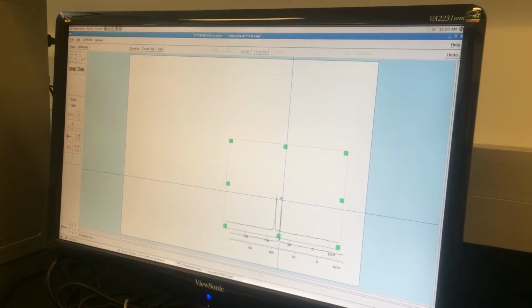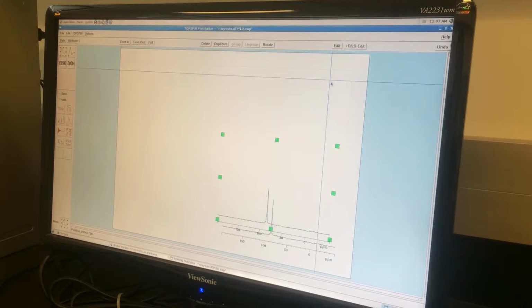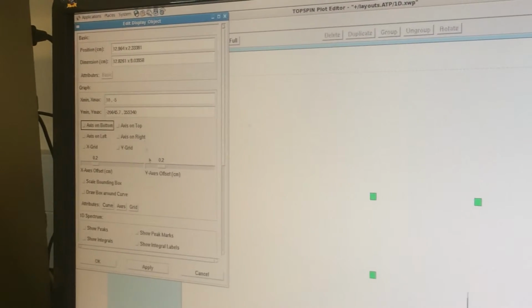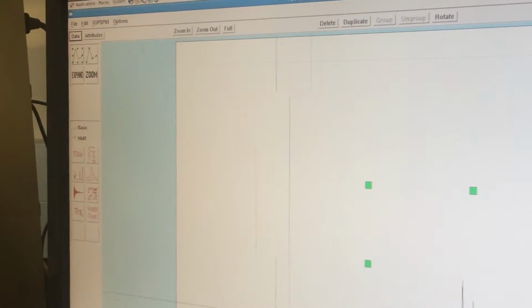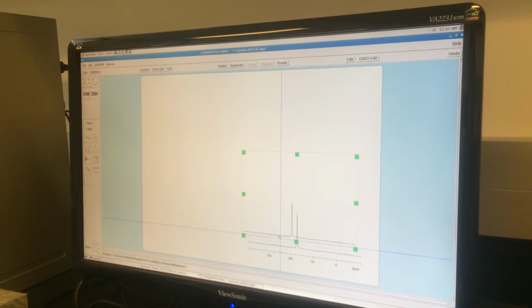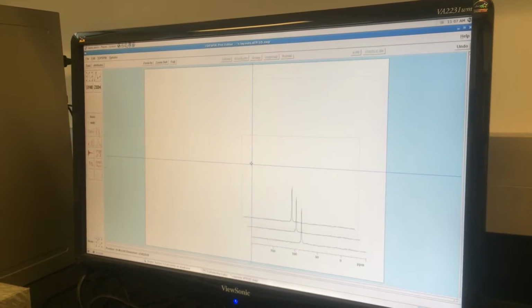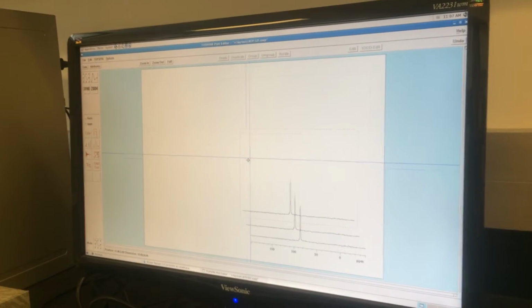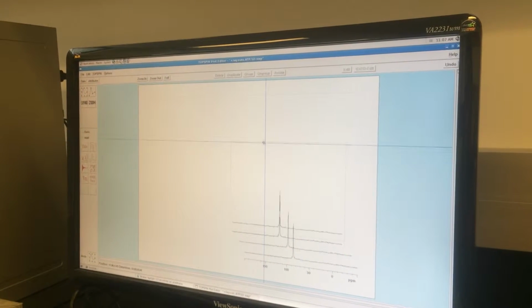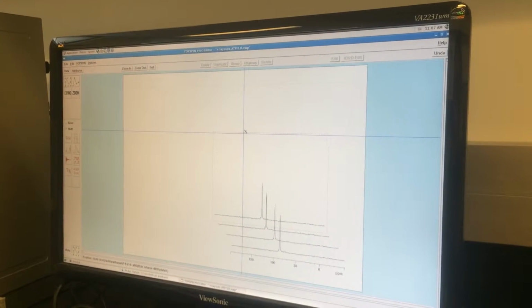The second spectrum also has the axes which you do not want, so you select that spectrum, go to edit and click on no axis at the bottom, and then you say OK. So the axis from the second spectrum is gone. Now you choose that spectrum and hit duplicate for another spectrum, and then you stack it. Then you again hit duplicate, and you can make as many stack plots as you want, you can stack as many spectrum as you want.